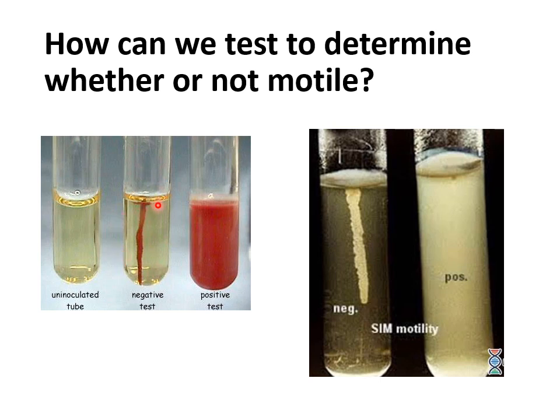If you ever look at a result like this one or like this one, and the bacteria stayed on a line, if you can see it as a defined line, then that bacteria is non-motile. It does not have flagella or any other way to move. It stays put.